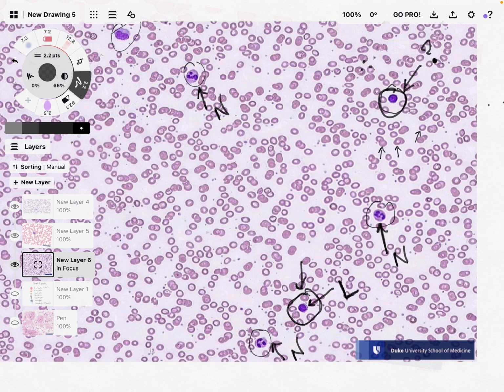And indeed it is. Lymphocytes have very large nuclei. So that is a lymphocyte. And this one, this mystery one here, is also a lymphocyte. So I'll put a little L for lymphocyte there. Again, if you're not sure whether that's a lymphocyte or a basophil, the two that are also easily confused, just like eosinophils and neutrophils can be easily confused with one another, you'll want to zoom in to a higher magnification. You may actually want to use oil immersion and go all the way up. So it's good to make sure you're looking at exactly what you think you're looking at.